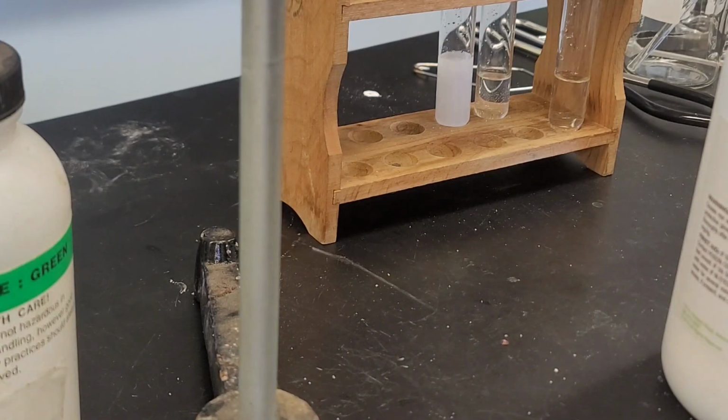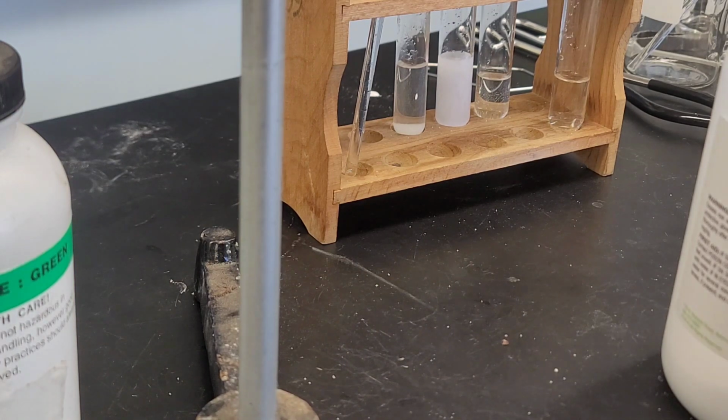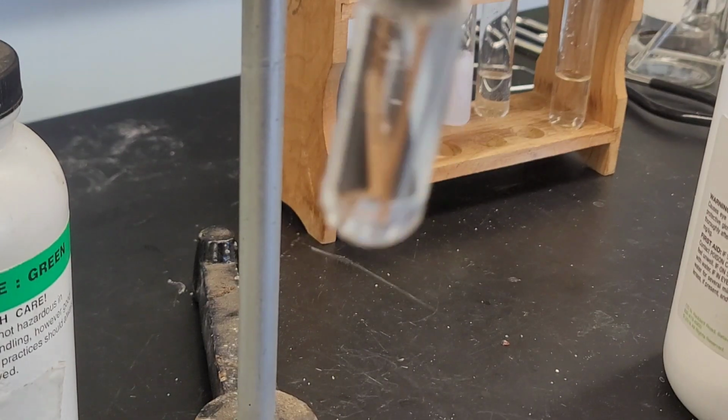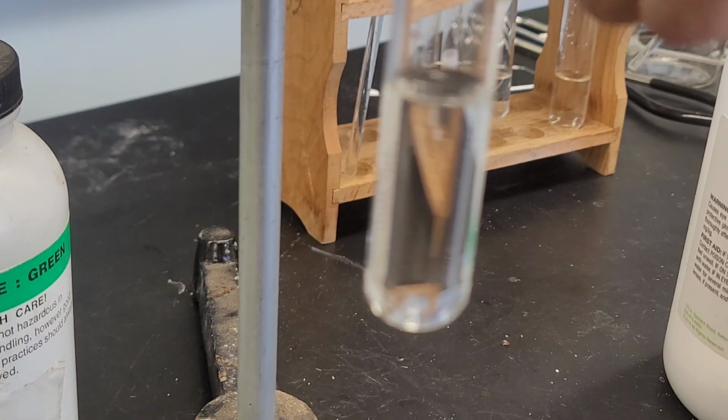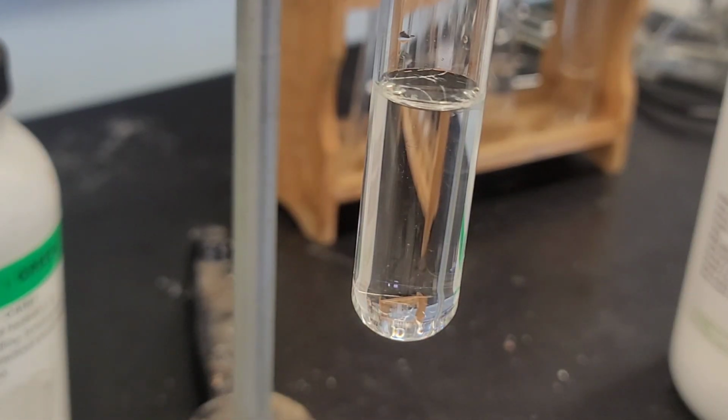Okay, now this is kind of interesting. This solution is supersaturated, meaning it's holding on to more dissolved solute than it should be able to hold. So I'm going to add a little bit more solute. In this case, it's sodium acetate, a type of salt. I'm going to add a little bit.